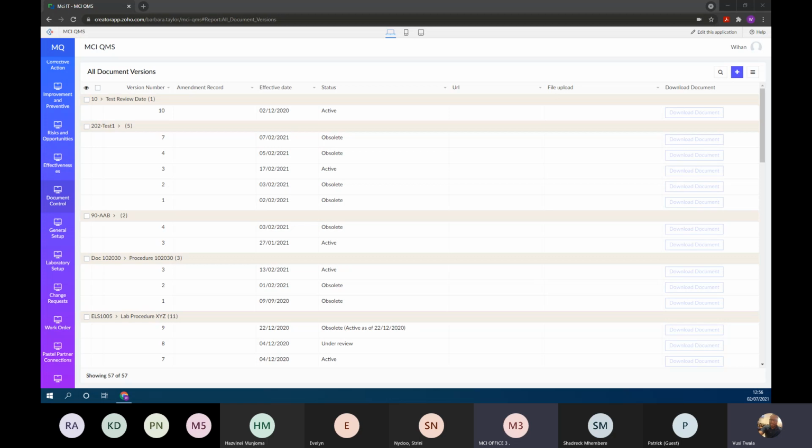That's what we provide for in the asset and the equipment and inventory management module, where, what I was referring to earlier with bringing in all those technical elements as well. So now it's not just a system that tells me I have this batch and it expires in a week from now. It tells me I have this batch of chemicals. It expires in a week from now. Here's the material safety data sheet. Here's the test method for the laboratory or the procedure to mix the chemicals. Information is power only if it's accessible.